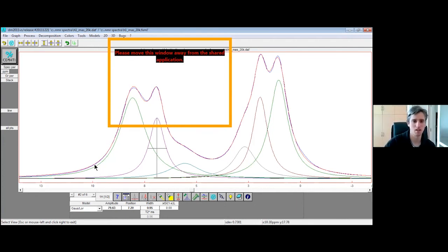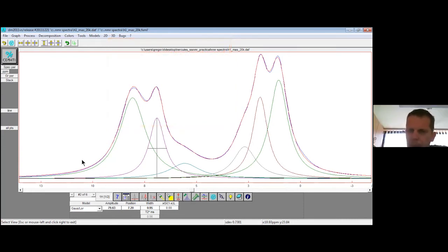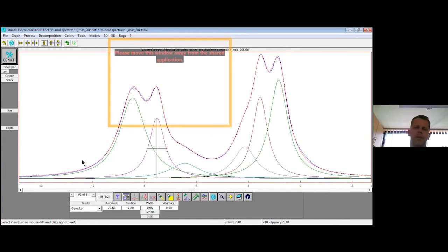Oh, thanks. Yeah, I thought so. I was just wondering if that was something that you knew because you knew that it was protons, or it was just because it fitted the data. Thanks. Yeah, it's a very regular question, of course. As I said, fitting is something where you have to decide often. Not everything can be done automatically. Sometimes the person has to decide or judge from experience. So yeah, this is it.